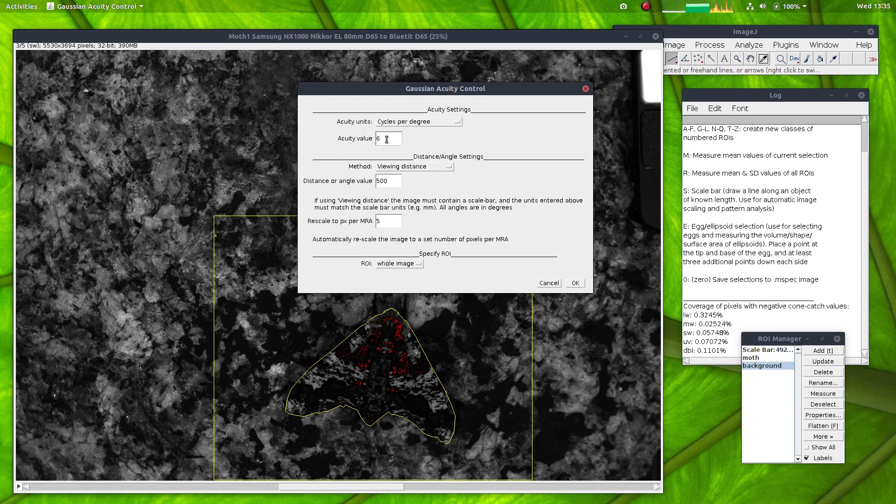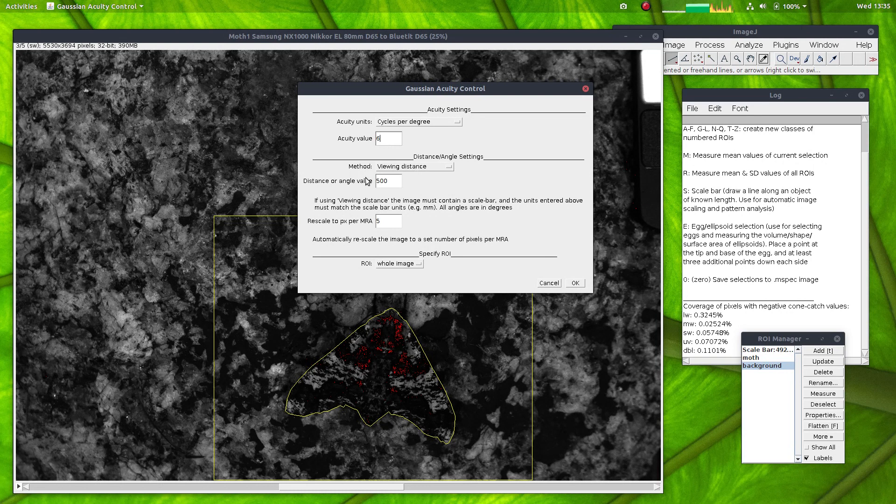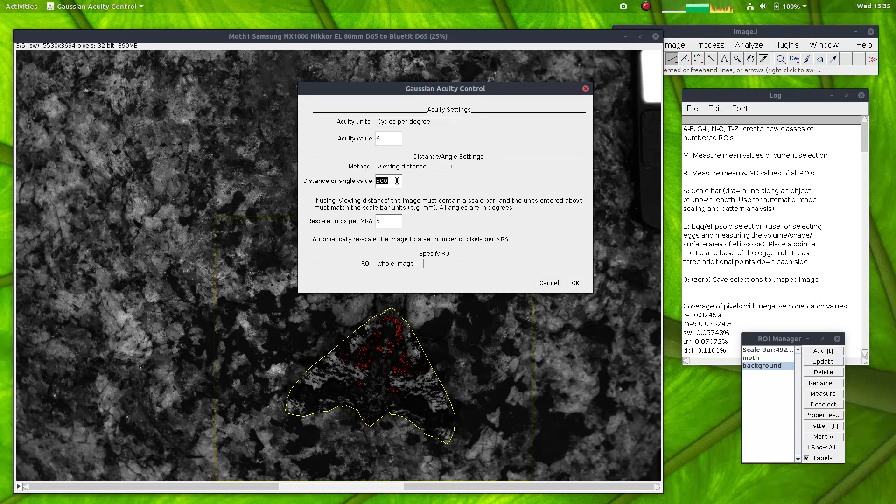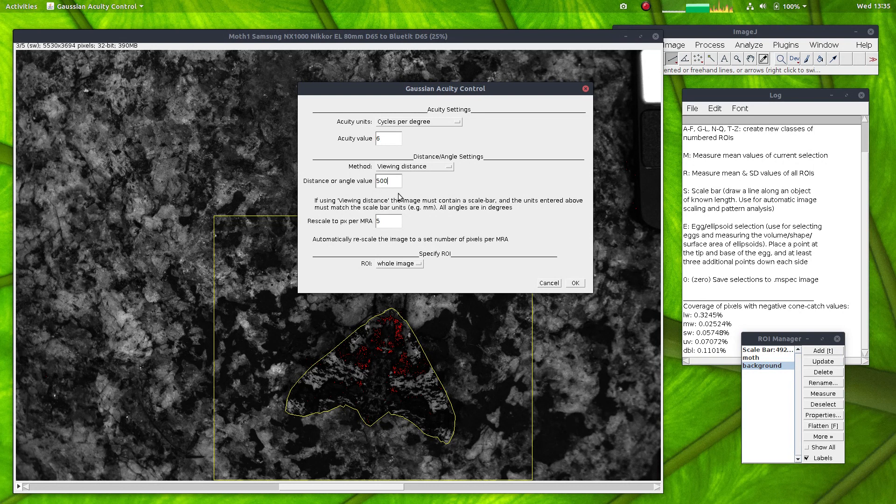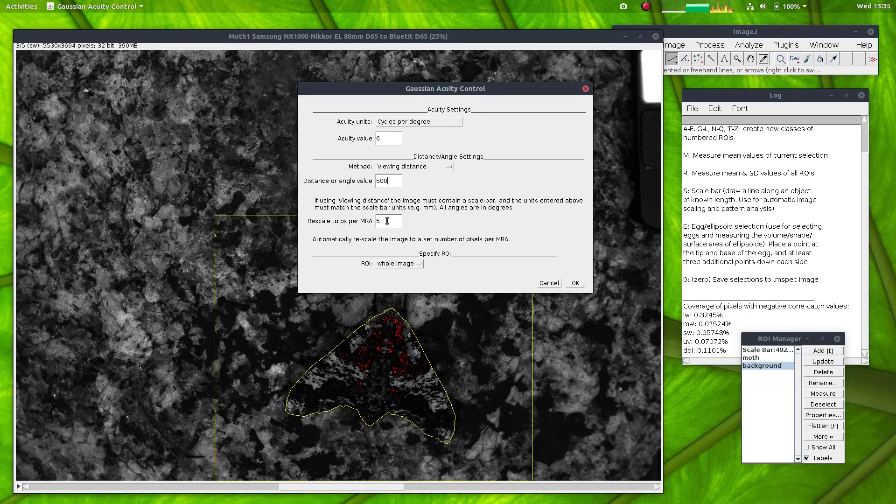It could be, though, anywhere probably between 5 and 20. Birds like blue tits, they seem to have traded off spatial acuity for temporal acuity, so they can see things very quickly. I'll simulate a viewing distance of half a meter. So that's 500 millimeters and scale to 5 pixels per MRA.